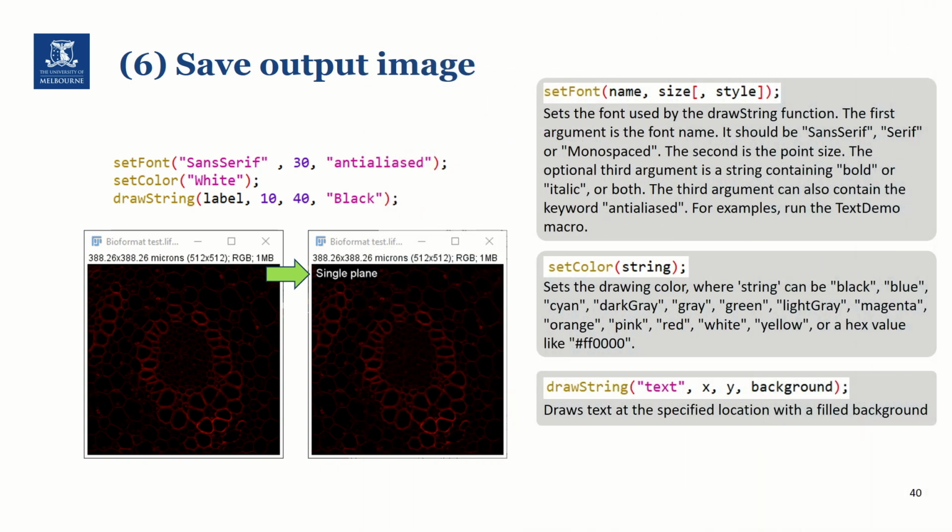Regarding how to use this labeling in various styles, there are very useful demo scripts on the built-in functions website, so please try them if you're more interested in this.